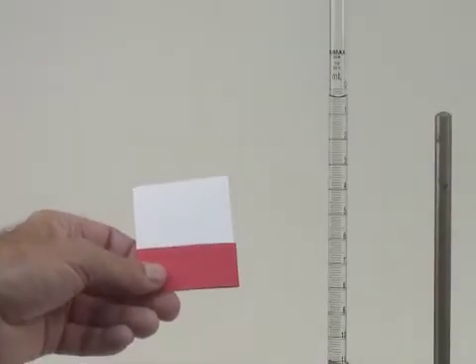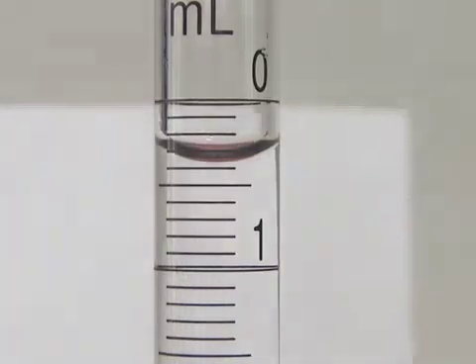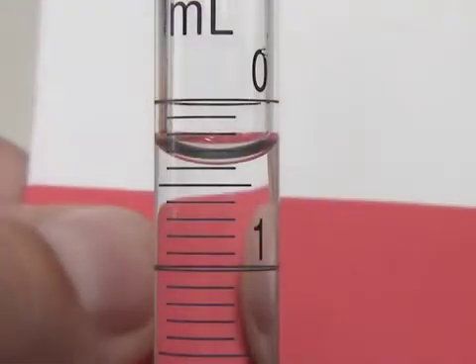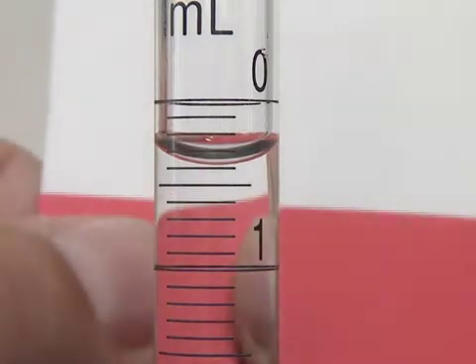We will read the meniscus with the aid of a card with a colored tape on it. Hold the card at about a 45-degree angle from the meniscus. This will reflect light from above through the meniscus. The colored tape should be just below the meniscus. This will turn parts of the meniscus the same color as the tape.